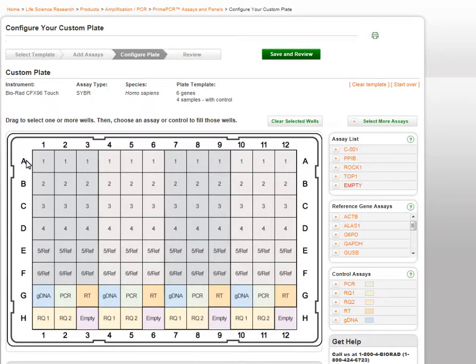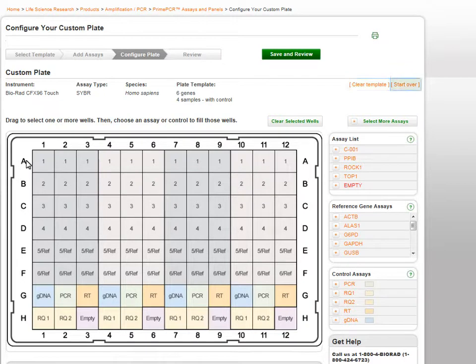On the plate configurator page, you will notice that the suggested plate template you selected is loaded. Note that the template is only a guide and will not warn you if you put the wrong assay in a well. If you would like to remove the template and use a blank template, click the Clear Template button. You can also start over if you would like to select a different template.